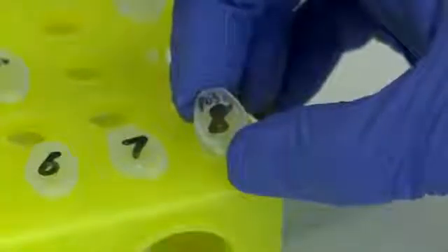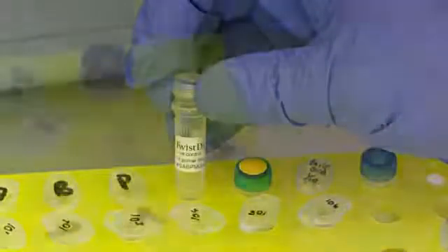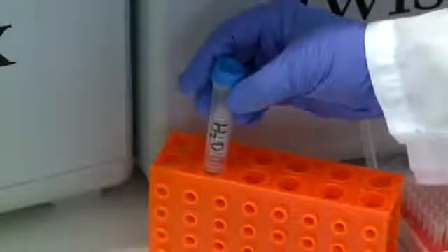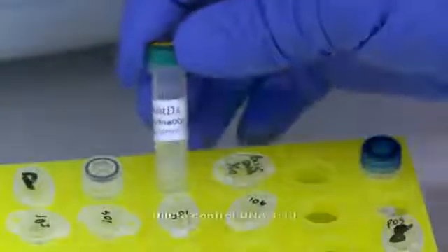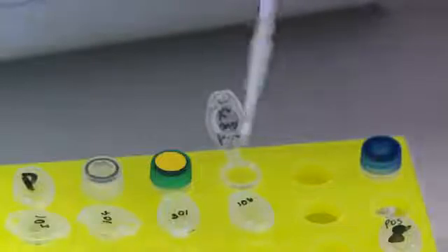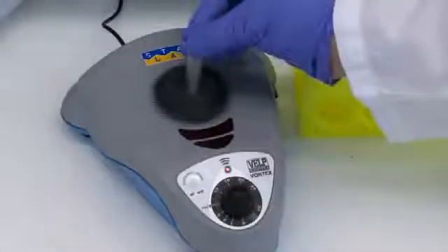Label a tube for your positive control reaction. In your positive control reaction tube, add the positive control primer mix, rehydration buffer, water, and positive control DNA.